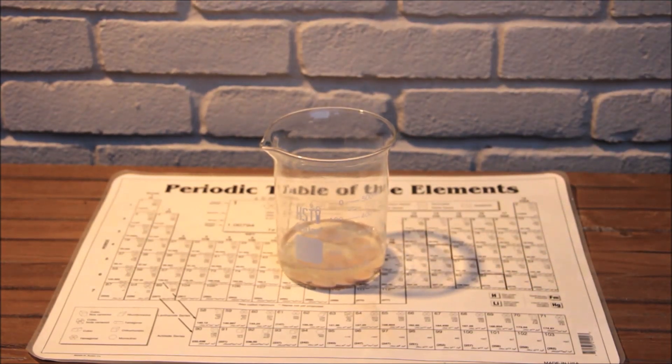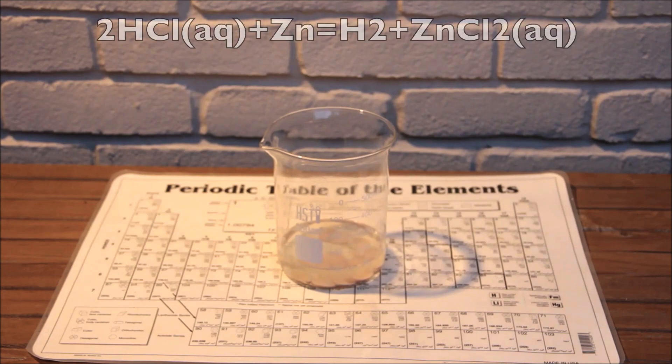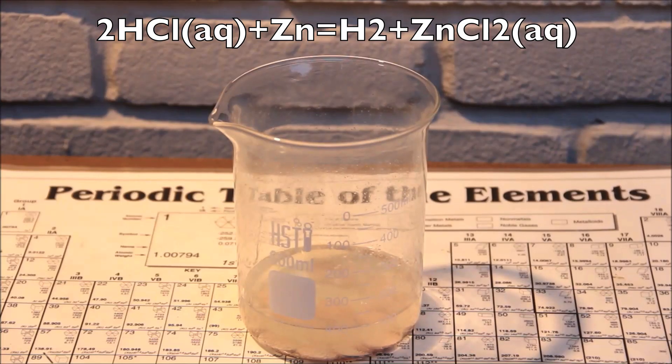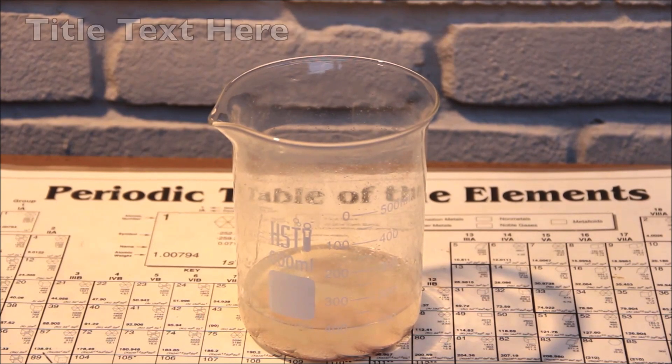Once the acid is added to the pennies, hydrogen gas is produced, which are the bubbles shown, and the corresponding zinc salt. Since I'm using hydrochloric acid, zinc chloride is produced.